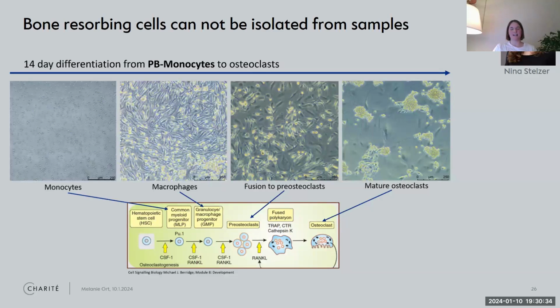And the thing is that you have to differentiate those cells directly on bone, on the bone scaffold, because once those cells have fused, you cannot get them off anything. Nina has, with another colleague, been trying to scrape off those cells from a tissue plate, and according to her, it was quite a ride. So you do have to differentiate osteoclasts on bone directly.